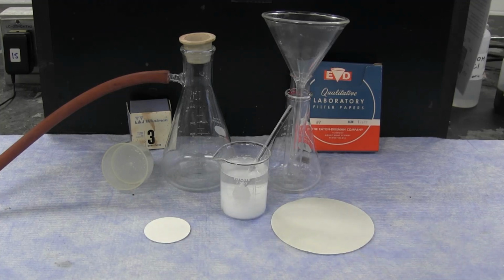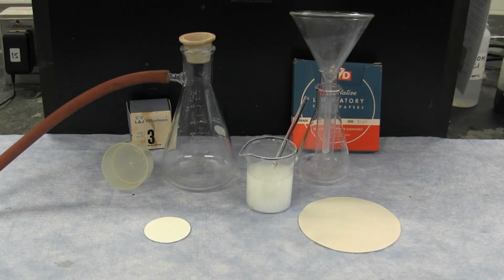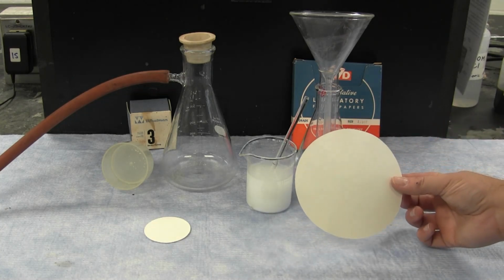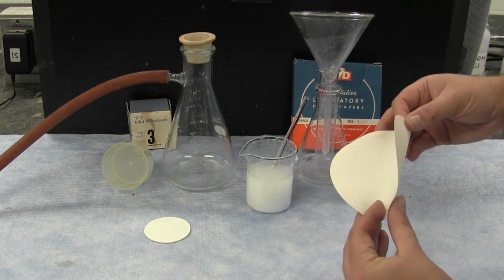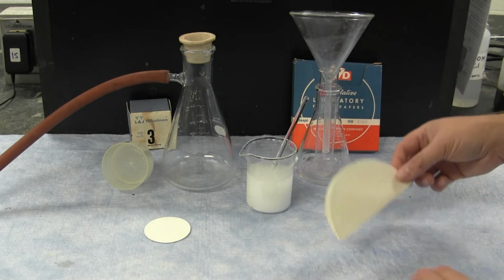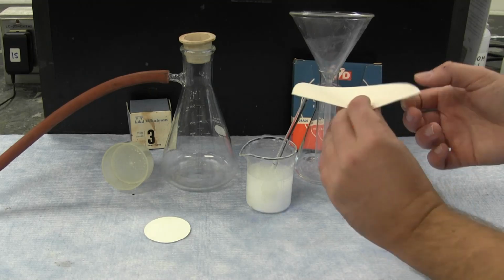In these two techniques, you can see the difference between gravity filtration and vacuum filtration. The more basic filtration technique with filter paper is gravity filtration. With gravity filtration, a larger circle of filter paper is folded in half into a semicircle, and then the semicircle is folded in half again.